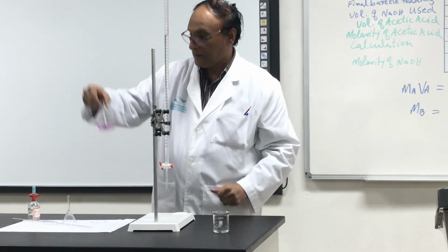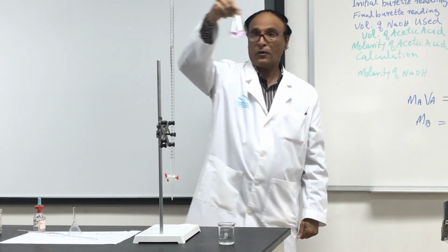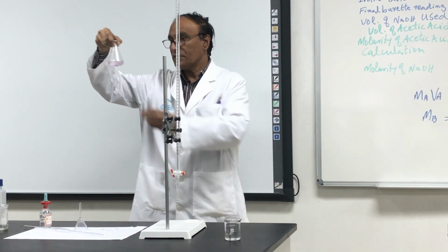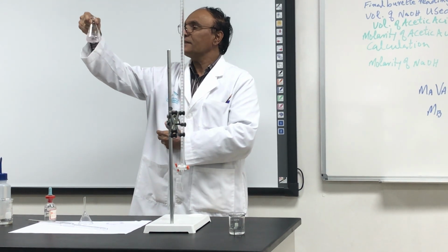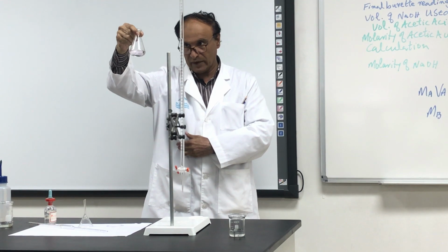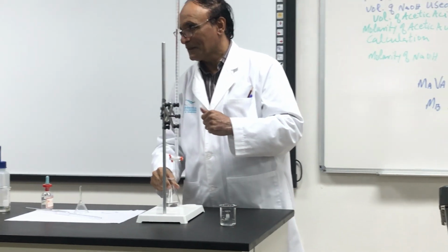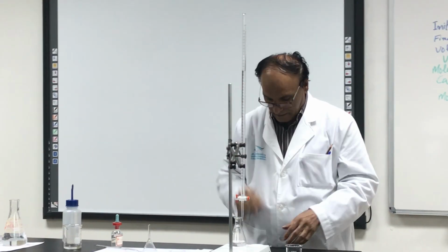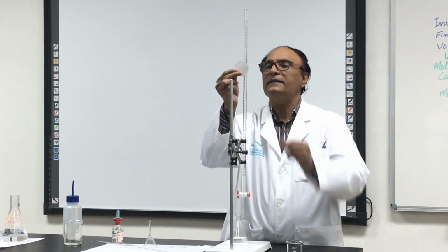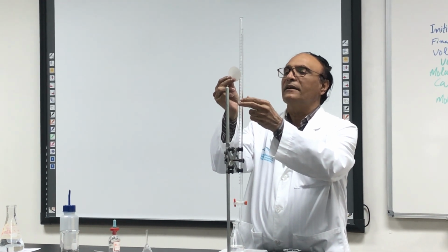Look, with one drop, did you see that one? Yes, with one drop it comes. So try to get it, it's very light. Maybe I have to add one drop more. Let me read it because maybe I will add too much. So make sure, how much is there? It is 13.5.